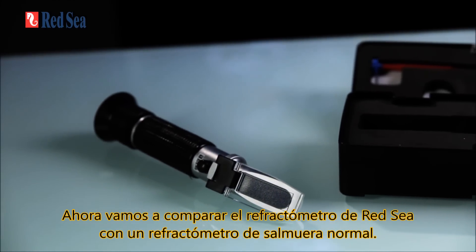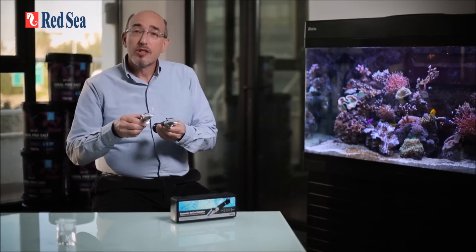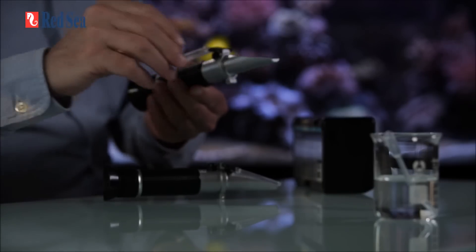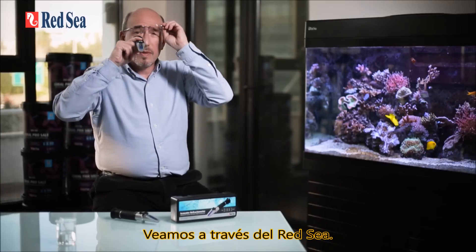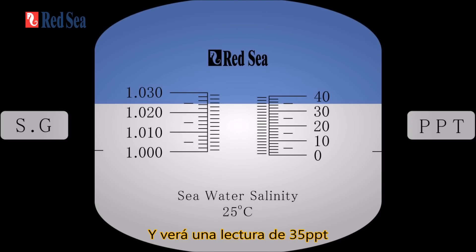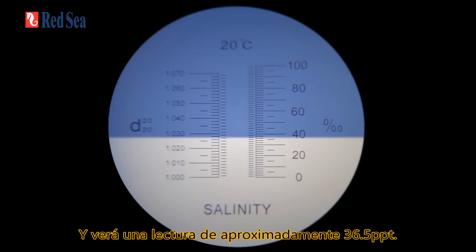Now let's compare Red Sea's seawater refractometer with a regular brine refractometer. We're going to put on a water sample and have a look through the lens. Looking through the Red Sea refractometer you'll see a reading of 35 ppt, while the regular brine refractometer gives a reading of approximately 36.5 ppt.